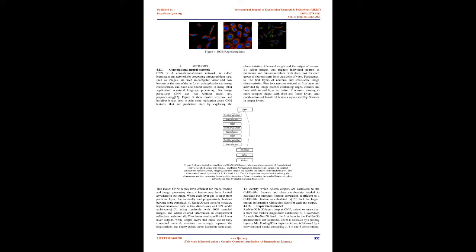Note that each of the image-level labels can be present in all or in just a fraction of the individual cells in the image, and that some individual cells may also have additional labels. For example, there are 4 cells, 3 have green staining, and the image-level labels are mitochondria and nucleoplasm.